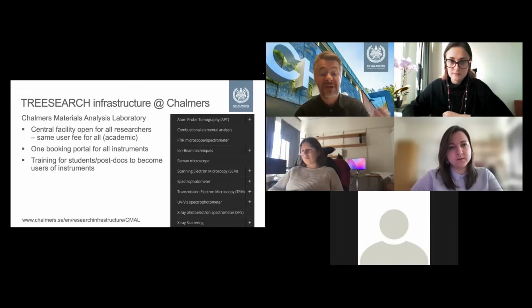Where we have technicians who take care of the instruments. There is one booking portal for all instruments where you can see if they're available. Also, this facility provides training for students, postdocs, well, also senior researchers, if you like, to become direct users of the instruments.